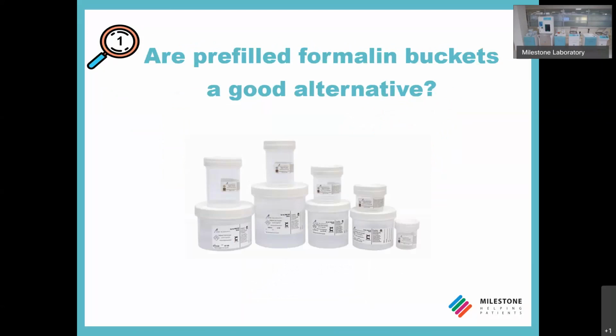Some groups of pathologists or operating room nurses adopt what are called pre-filled formalin buckets. By pre-filled, I mean containers that arrive from the supplier sealed, typically with 50% of their volume already containing 10% neutral buffered formalin. So the operator in this case doesn't need to dispense formalin from a larger container, simply opens the lid, drops the biospecimen and closes the lid. So pre-filled formalin buckets are a good alternative to prevent exposure.